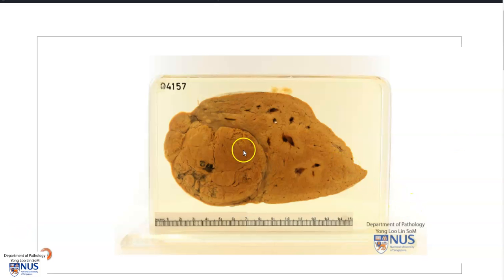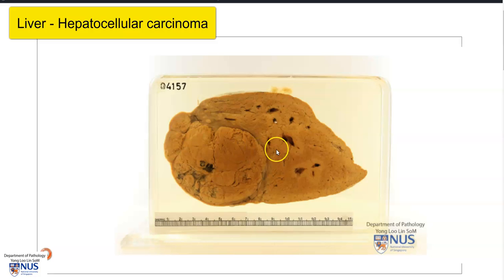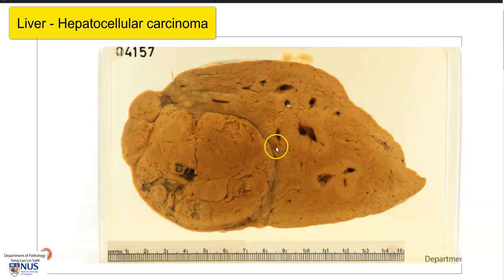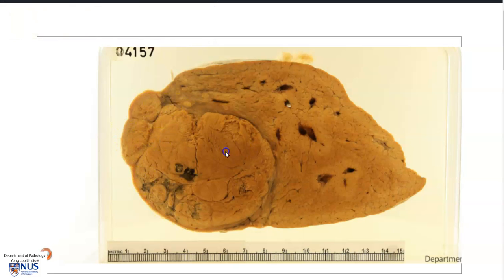Hello, this is a virtual pathology specimen of an example of hepatocellular carcinoma, which is a malignancy arising from the hepatocytes. Here we have a slice of the liver, and we can see this relatively well-circumscribed nodular tumor mass.